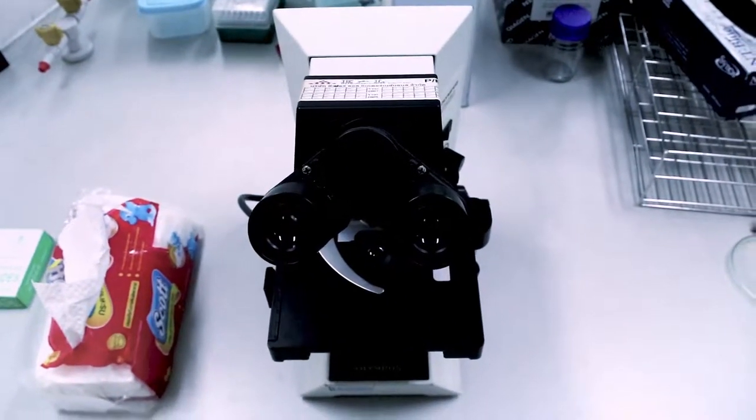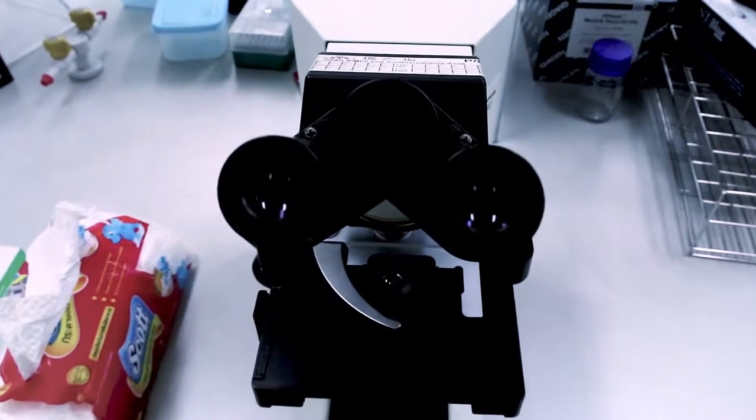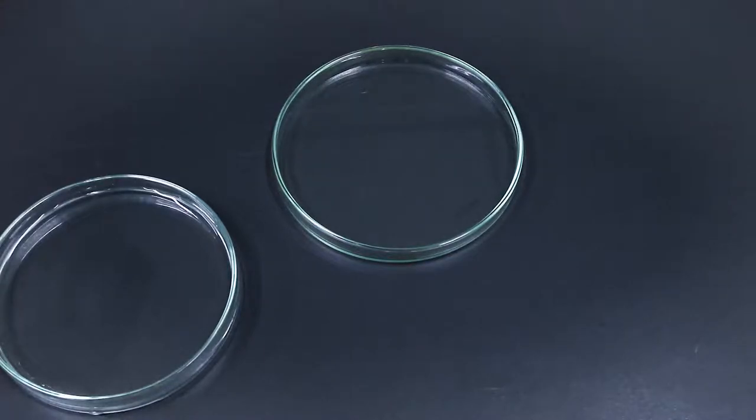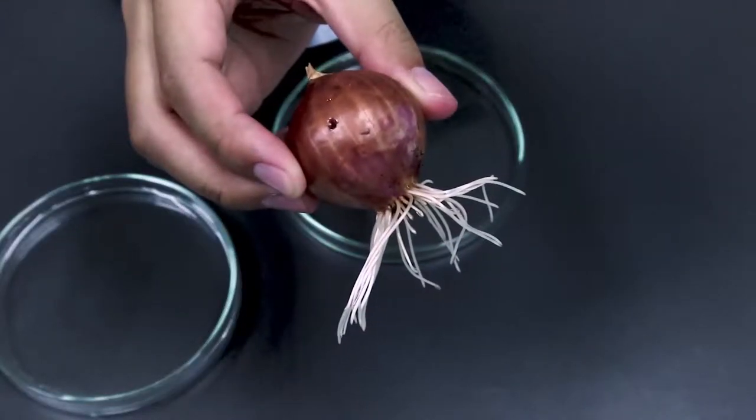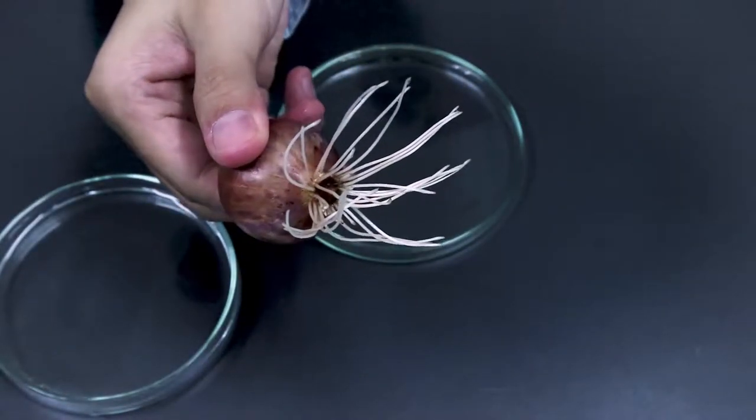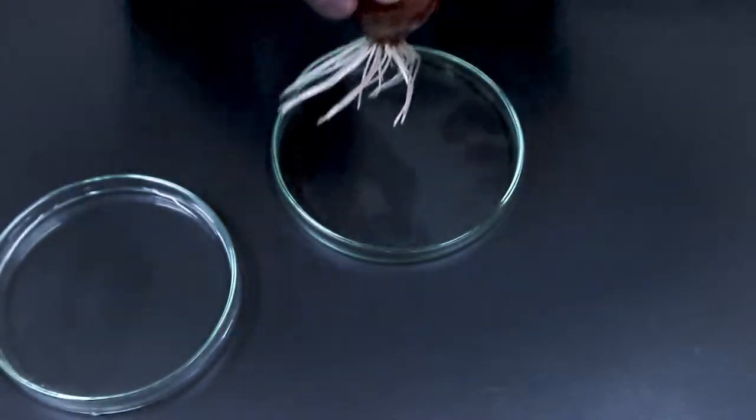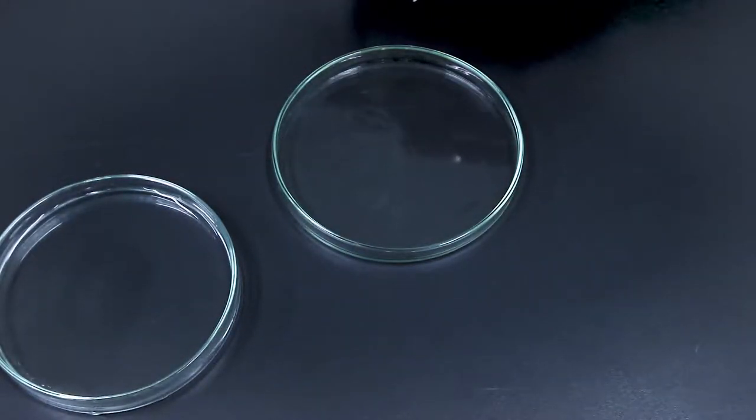So here the microscope, tissue paper, and we're going to start with providing you the root tips of the onion. Here's the onion that we have soaked the bottom of in water for two to three days.